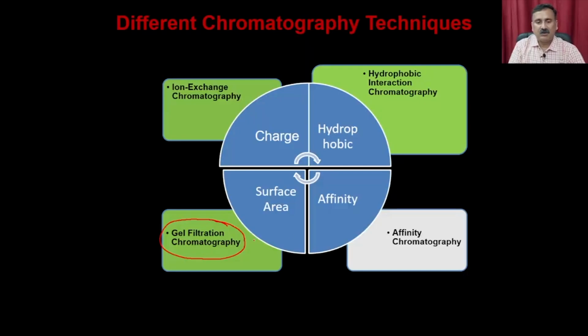So this is all about gel filtration chromatography, where we have discussed the principle of the technique, how you can exploit the technique for purification of proteins, and how you can perform gel filtration chromatography.